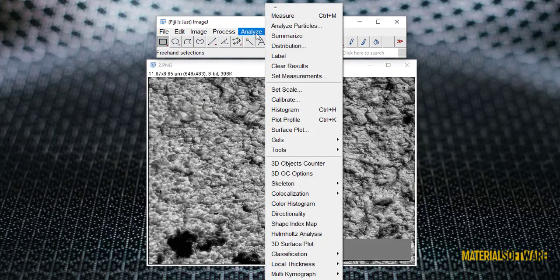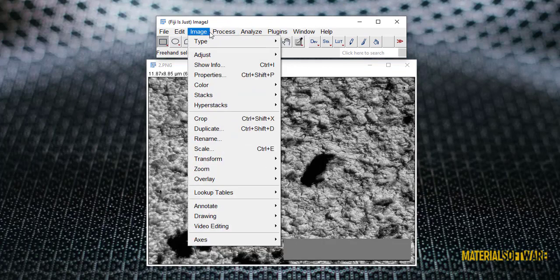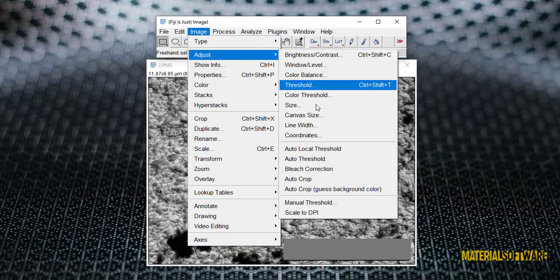At this stage, a new window will open for you.